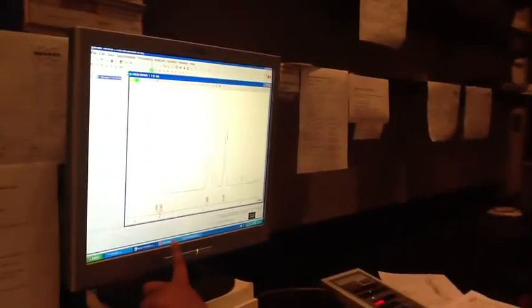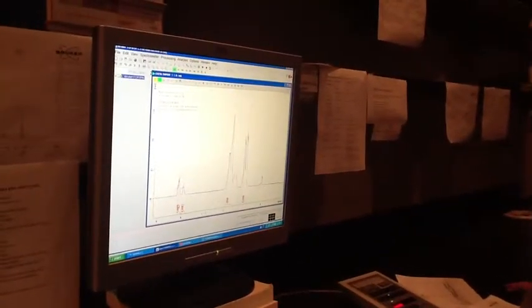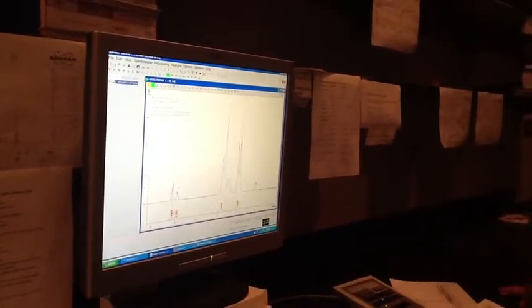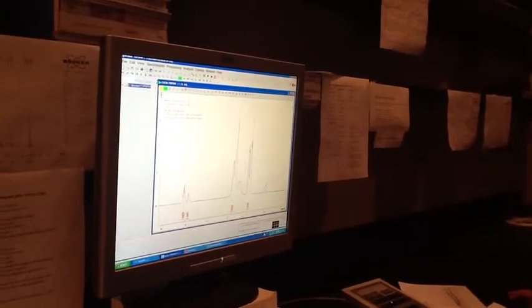Okay, think about it. 2-pentanol, you have two products, right? So it's the second product's hydrogen, because there is nothing else in that same molecule that will come in around 4. They're all CH, in the alpha region, right? So this has to be from the other molecule. Based on this, can you predict the percentages of each? It's going to be more on the one upfield, I think, because wouldn't the rearranged one be more stable?